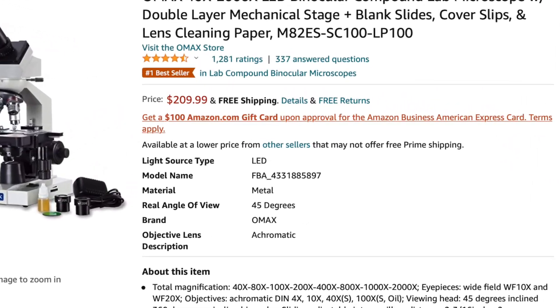For homeschooling science, a microscope is a must. The problem with microscopes is good ones are really expensive, and cheap ones are just that — cheap. Their picture quality is poor, their magnification is bad, so you end up getting a terrible picture. So when my wife came across this $20 microscope, I had my doubts, and when they advertised it coming with its own cell phone clip adapter, I was even more skeptical.